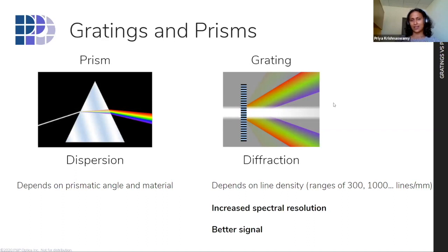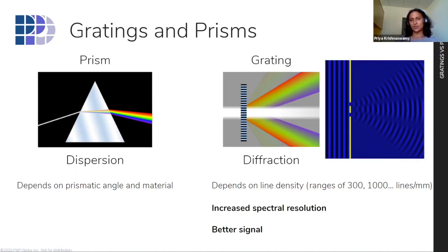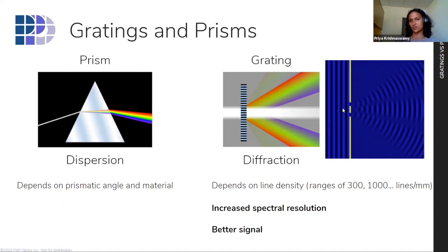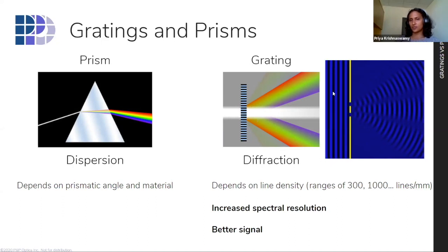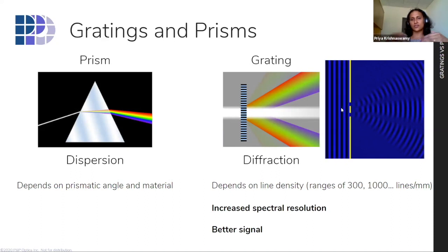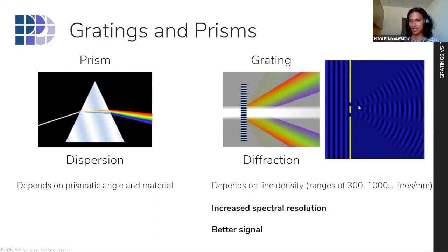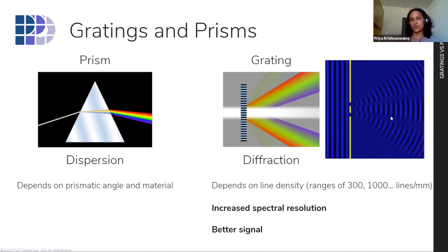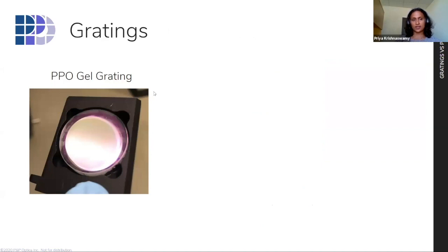And we all might be thinking, it's a completely new concept and there is no way I'm going to understand it. And this is an animation showing how a grating is formed, because you have plane waves coming in. You could have seen it in how water comes through rocks and they form waves. Here you can see it is destructively interfering, and in the other one the peaks coincide and it constructively interferes. So you have the bright and dark lines, and gratings are built through interference patterns. So this is how a gel grating looks.